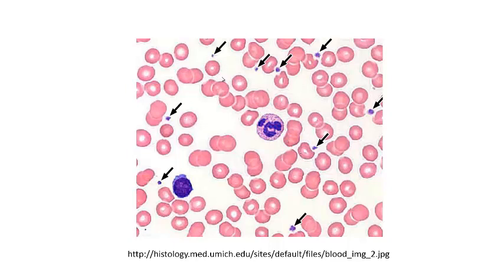These are our erythrocytes, and the erythrocytes have a biconcave shape, so in the middle of each one sometimes they appear white, and that's just because of the biconcave shape. The light is coming up through them, and there's not as much hemoglobin in the middle of each red blood cell, and so they just appear lighter. There's more hemoglobin around the edges.